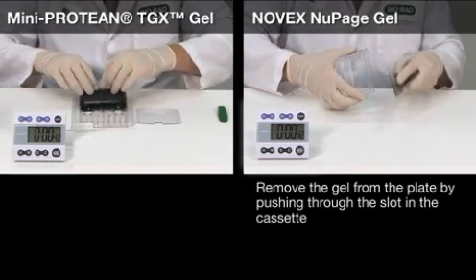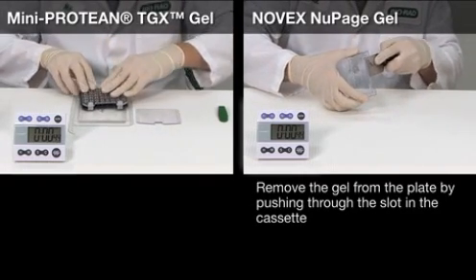To remove the Novex NuPAGE gel from the plate, you need to push the gel through the slot in the cassette.